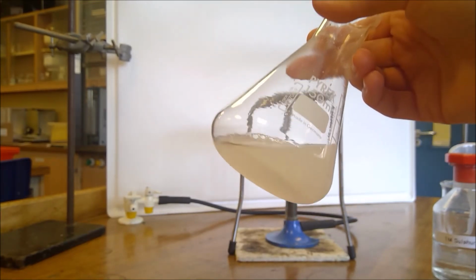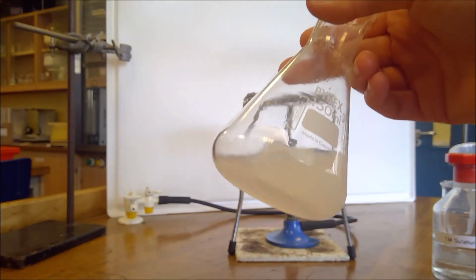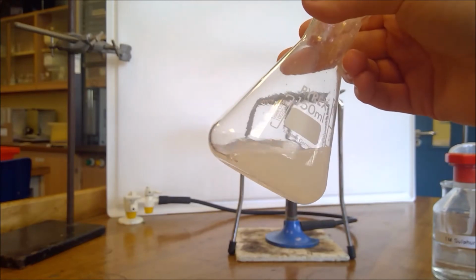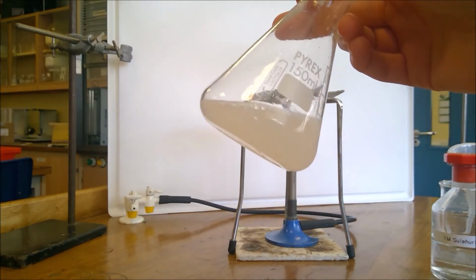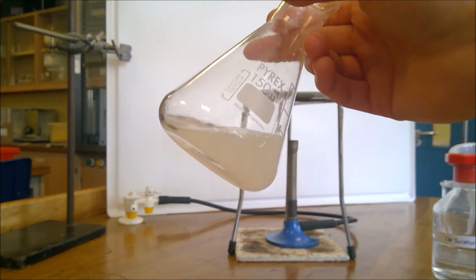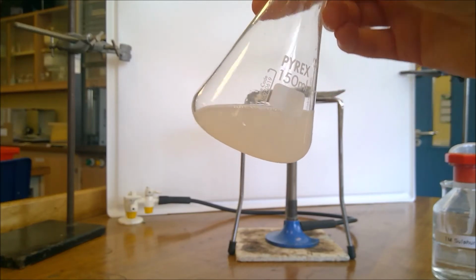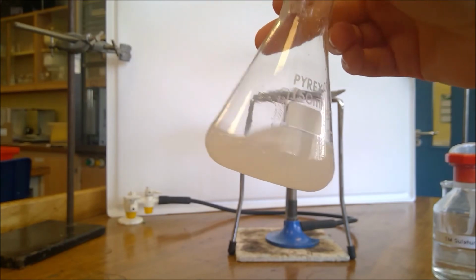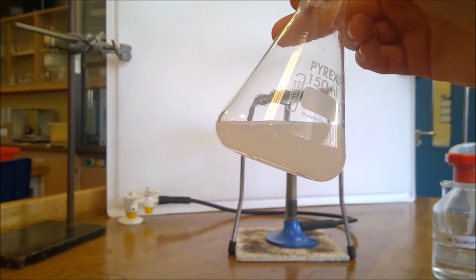So in order to ensure that all our acid reacted, we kept adding the carbonate, observing the effervescence, and we continued until we had added excess magnesium carbonate. So with the term excess, we mean that we added more than we needed to complete the reaction. And we knew we got to the point of completing the reaction because the extra bit has stayed behind, and that's what's causing this to go cloudy.